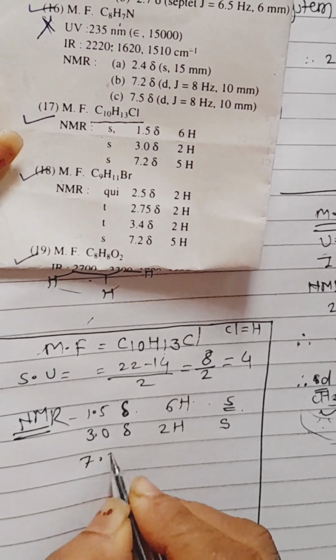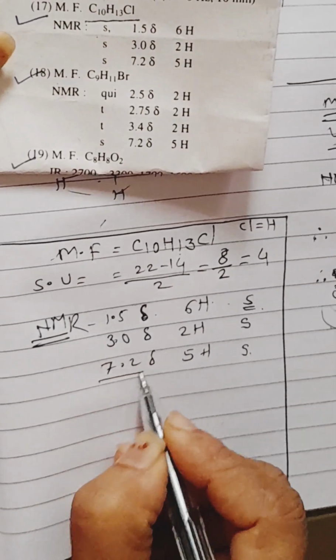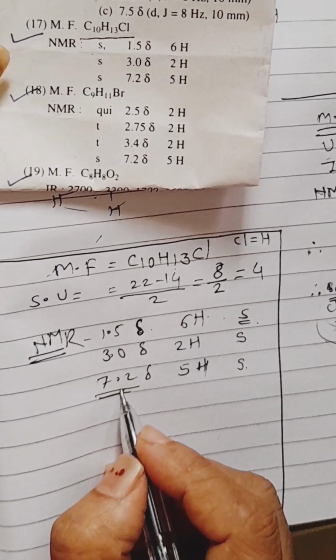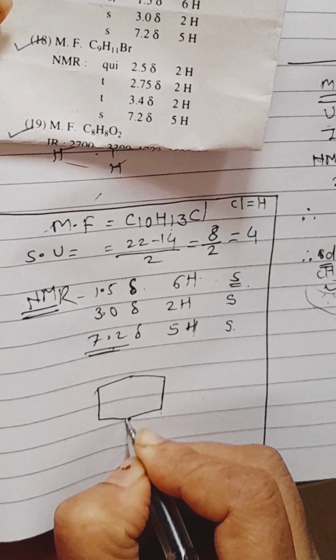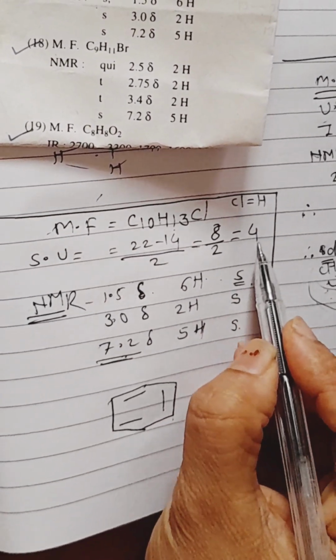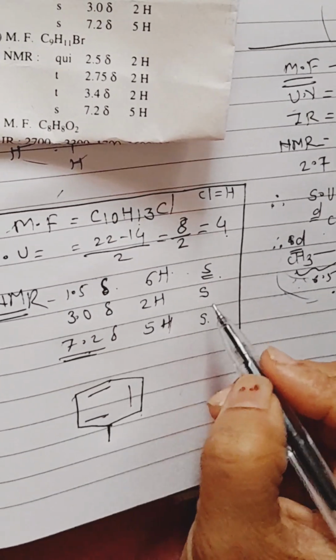And 7.2 delta, 5 hydrogen atoms, singlet. Now it is very important information that 7.2 delta with 5 hydrogen atoms means it is a monosubstituted aromatic ring, and the 4 sites of unsaturation are satisfied in this ring.